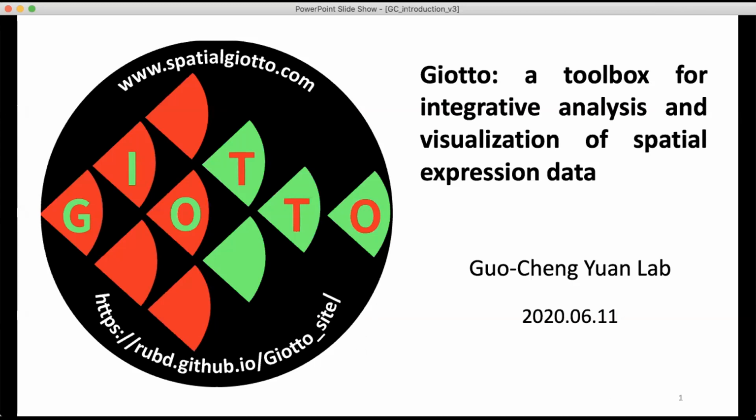We are very excited to present you our newest software called Giotto. And just quickly introduce ourselves. My name is Guocheng Yuan, also known as GC. I'm a faculty of computational biology at Dana-Farber and Harvard Medical School.